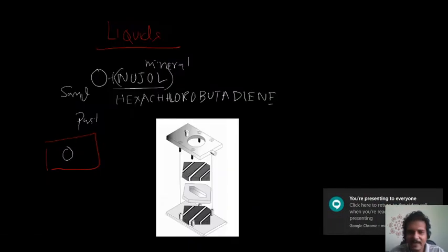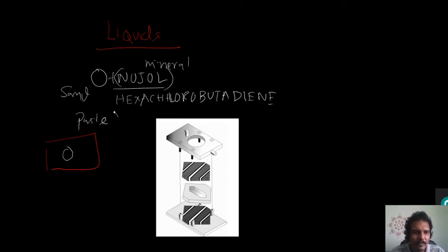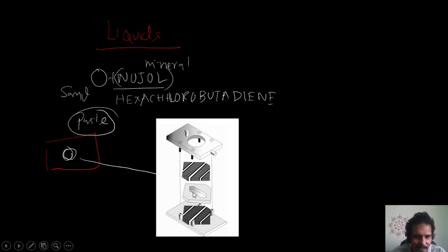Okay, it will be made into a paste. This will be made into a paste. In the paste, on a plate, they will have a drop of that paste. This is that one. இந்த இடத்துல காட்டுறாங்க இல்லைங்களா, this part இந்த பிளேட்ல கொடுத்துருக்கிற ஒரு drop. This is actually the sample mixed with nujol.